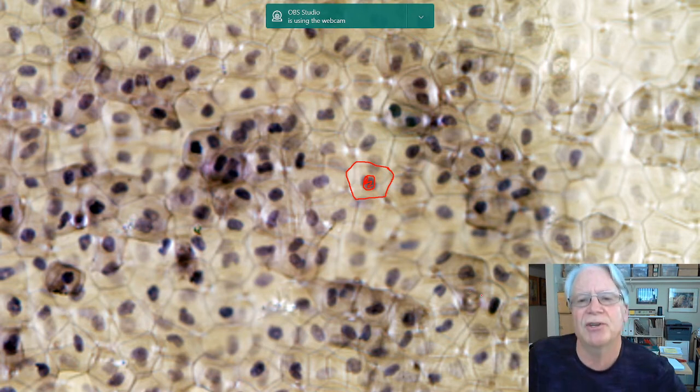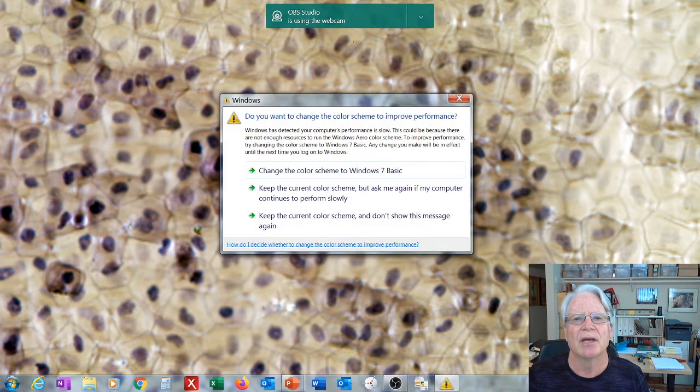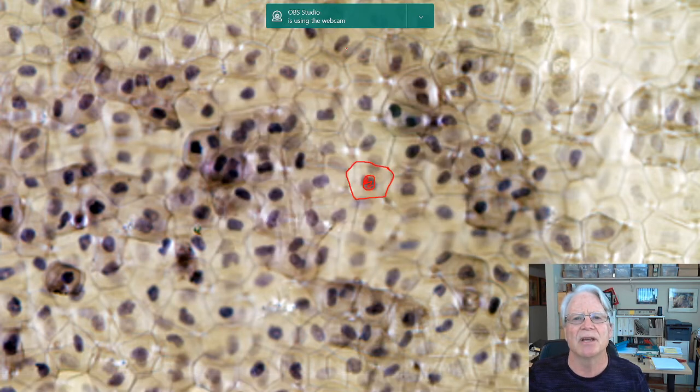Now, remember when I talked in lecture about looking down from the top and saying to yourself, I don't know if that's multiple layers or a single layer. I told you that if it were multiple layers, you would see ghost-like nuclei underneath. If you look up here, for example, you're looking at a little ghost-like nucleus here and a dark one right there. And you might say, oh, that's what he's talking about. But that means that we have multiple cells.